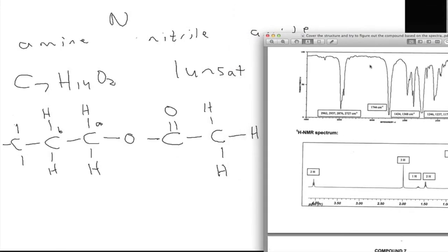So there's a couple different ways to see that. We can tell that this is this peak because it's farther to the left, and also it's a singlet, which would make us think it's attached to the carbonyl. All right, so now we're in pretty good shape. So we know this peak here was these two hydrogens, and this peak was these two hydrogens. And now you should probably be able to figure out what's left, because we have the two methyl groups.